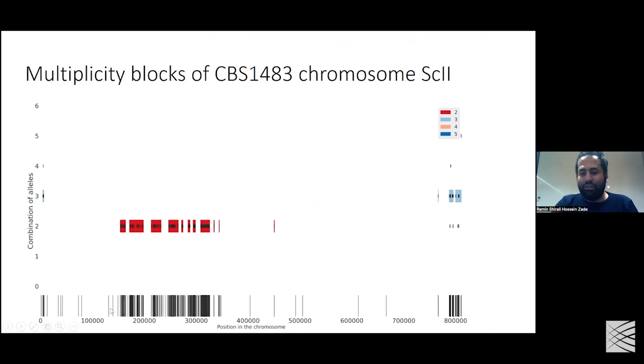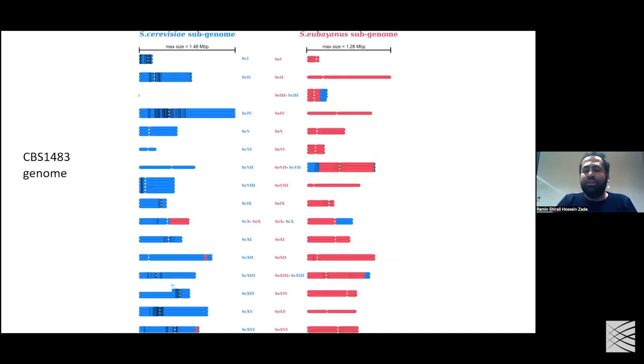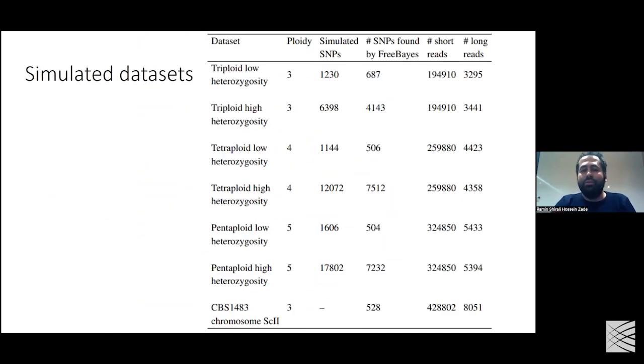This is what I'm calling a variation desert. If you look here, there are some regions, yeah. The model was basically modeling these parts where the SNPs are very close to each other. But at some point there is a huge variation desert where you don't see any SNP, and the simulator was not modeling that. So that's why they have more heterozygosity.